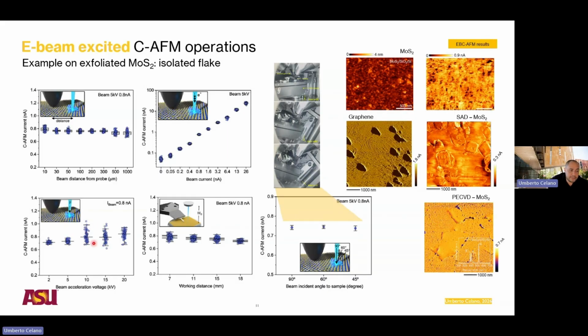It comes up at certain values of your beam energy, which in our understanding probably has to do with the fact that at very high energy we also generate a lot of secondary electrons that almost inevitably get into our probe. They get launched into our probe as some kind of parasitic current, and that is messing up our signal-to-noise ratio.